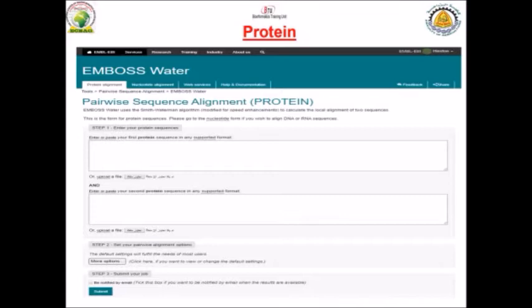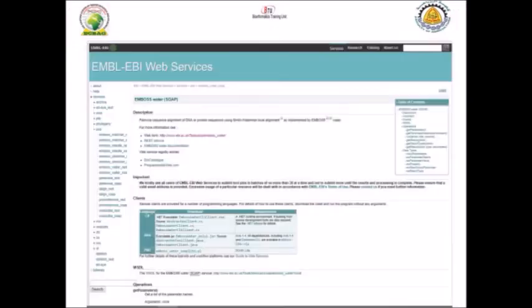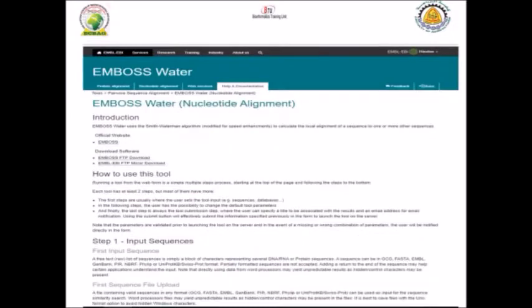As we said before, you can use either protein or DNA sequences. When you want to use DNA or nucleotides, you can just copy both sequences into these two boxes. You can read more about the web services and help documentation about this tool, and it's very easy to use. By hitting the submit button, you can get the result almost immediately.